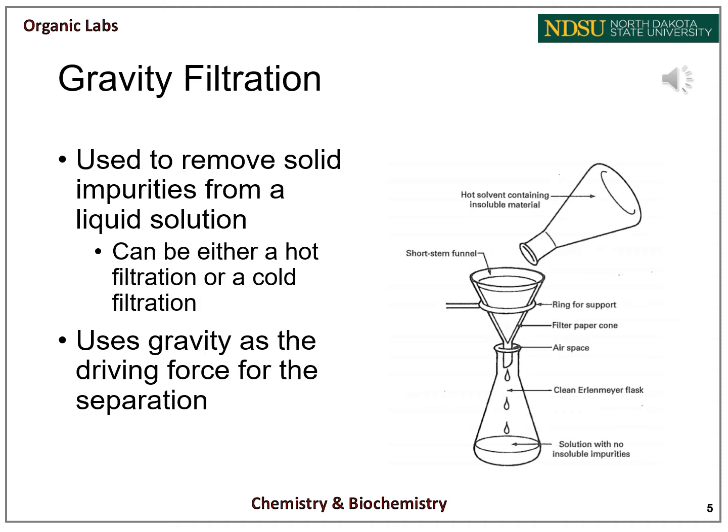The hot solvent with insoluble impurities is then poured into the filter, and the hot solvent drips through, leaving the solid impurities behind. Now, you can kind of think of gravity filtration as similar to making a pot of coffee. There's a physical setup with a glass funnel suspended above the collection flask with a piece of filter paper inside. And this is similar to a coffee pot, which has the coffee maker, the coffee pot that will eventually hold your freshly brewed coffee, and the coffee filter to separate the coffee beans from the freshly brewed coffee.